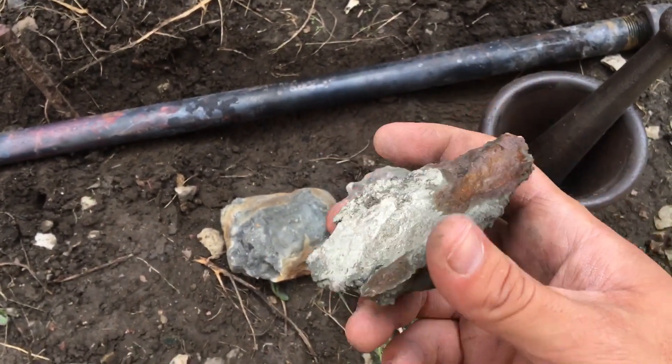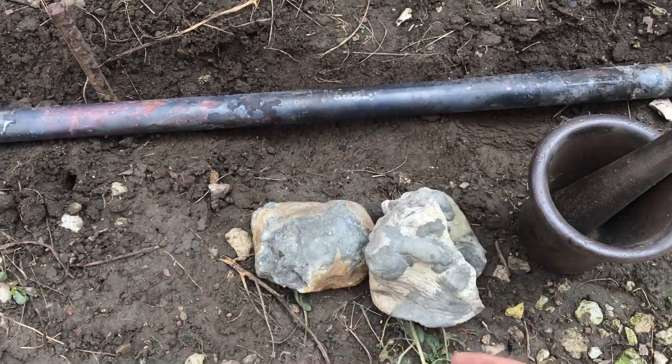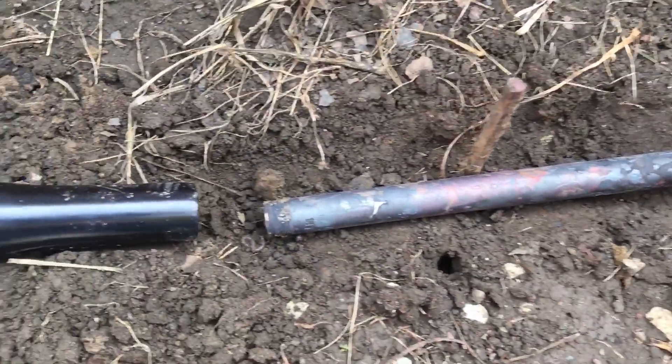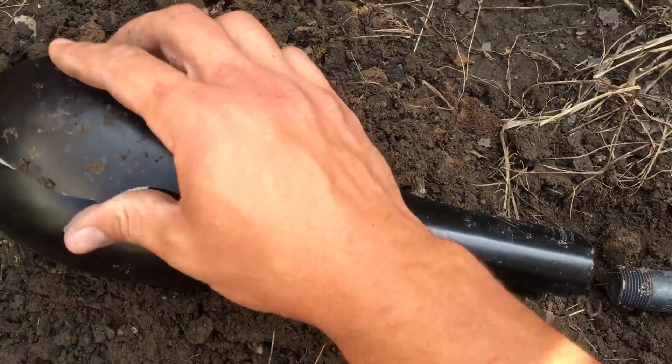The idea is I'm going to crush it up and then put it in this iron pipe back here. Heat it up to red hot, and one of those sulfur atoms should be released by the heat. It will go up this pipe — I'll have it sealed on with clay, and then this bottle will be sealed up too.